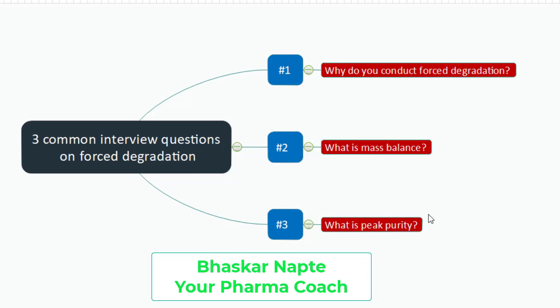And if you prove that the spectra are similar across the peak, that means the component that you are measuring as a peak is one and the same, because all the spectra are similar and hence they must belong to one and the same component. If they belong to one and the same component, that indicates that there is no co-elution happening within this peak. I prove that if the peak is spectrally pure, there is an absence of co-elution. I am talking about only one compound as a part of this peak, and that is the very reason for understanding the peak purity.